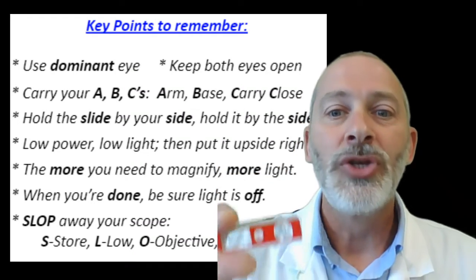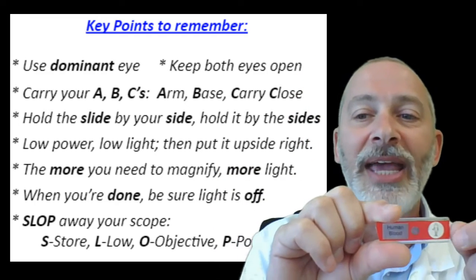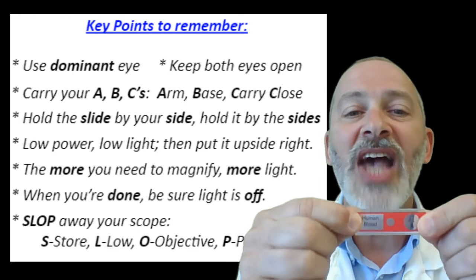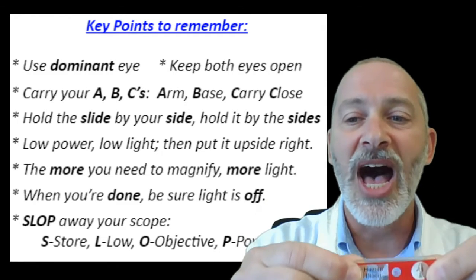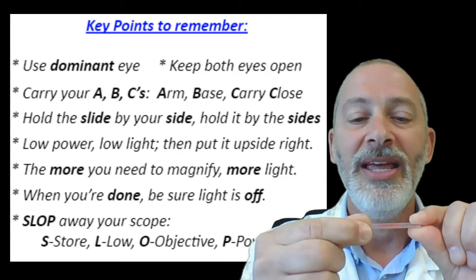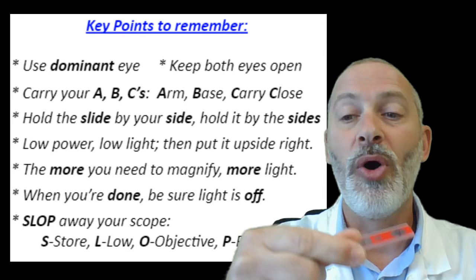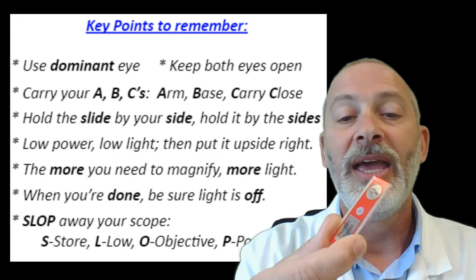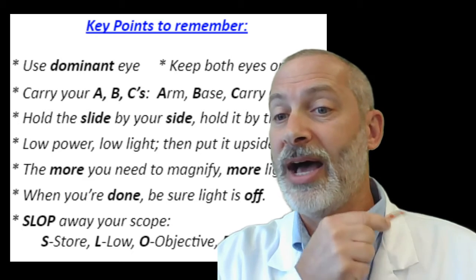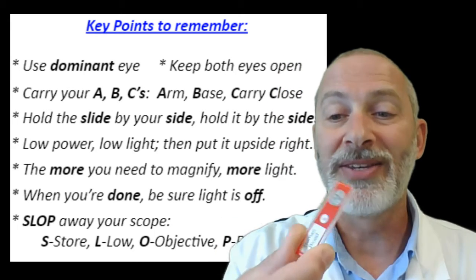So you always want to hold your slide by the sides. Hold it by the sides. Better yet, the side of the slide. Because if you hold it by the side of the slide, close by your side, not your neck, but your side down lower, you won't smudge the specimen.